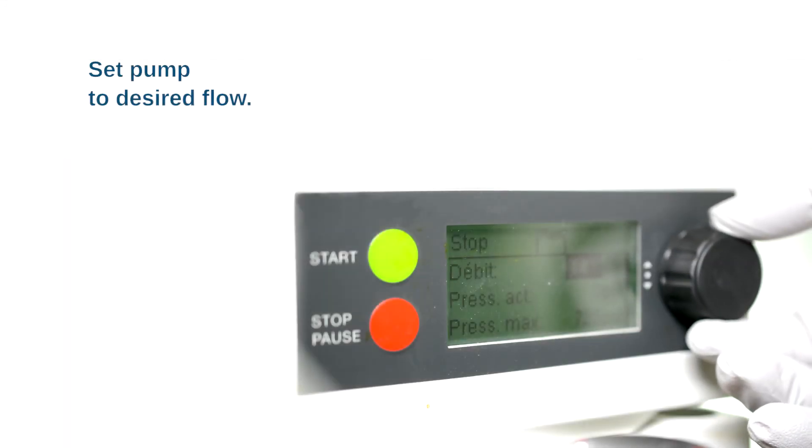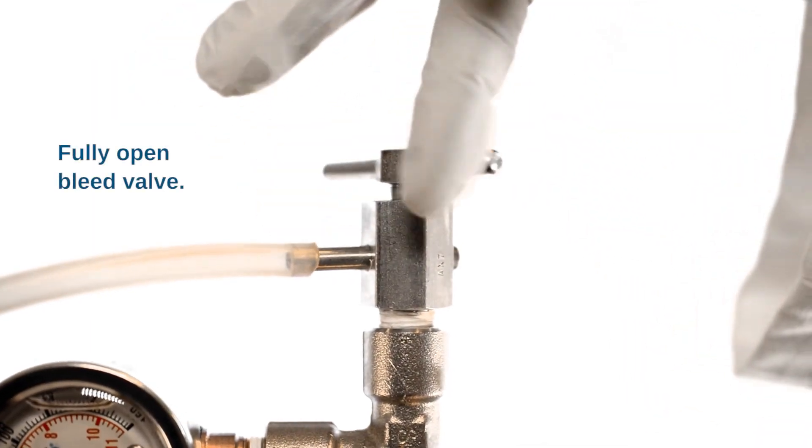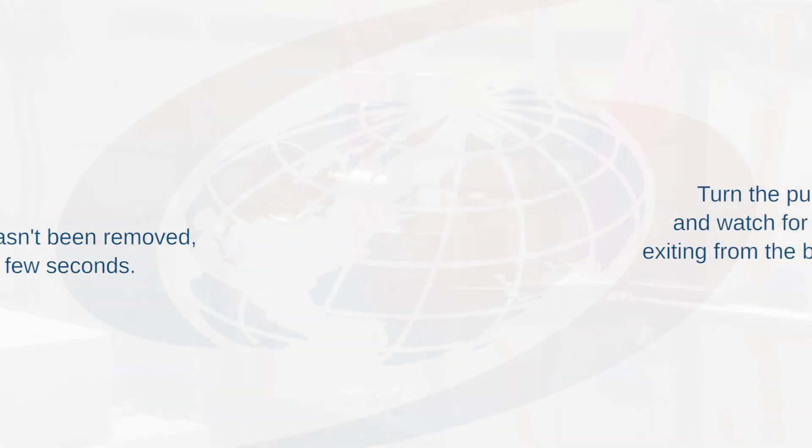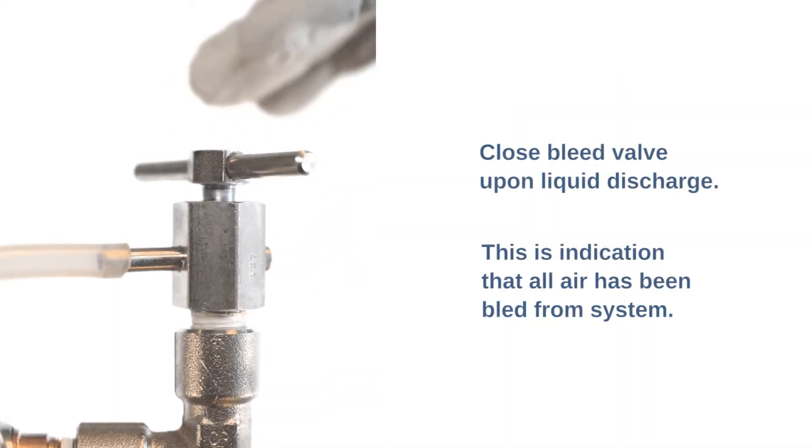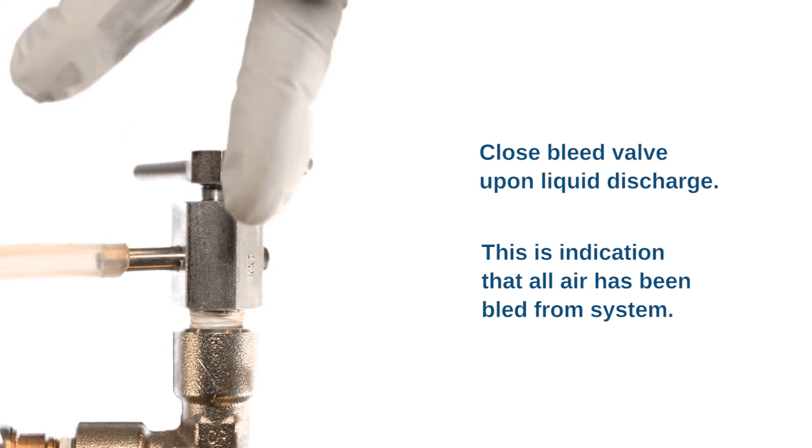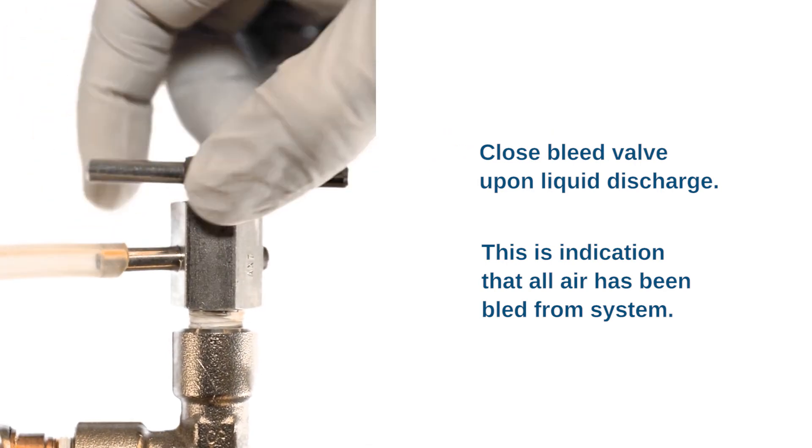Set pump to desired flow. Fully open bleed valve. Turn the pump on and watch for test fluid exiting from the bleed valve. If the pre-wash solvent hasn't been removed, it might take only a few seconds. Close bleed valve upon liquid discharge. This is indication that all air has been bled from system.